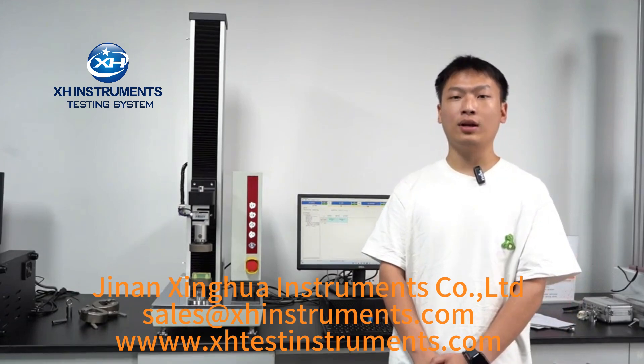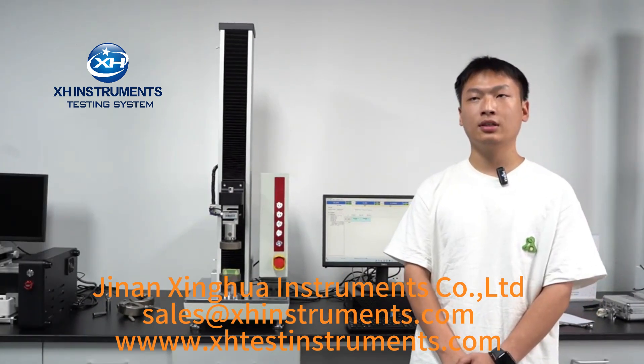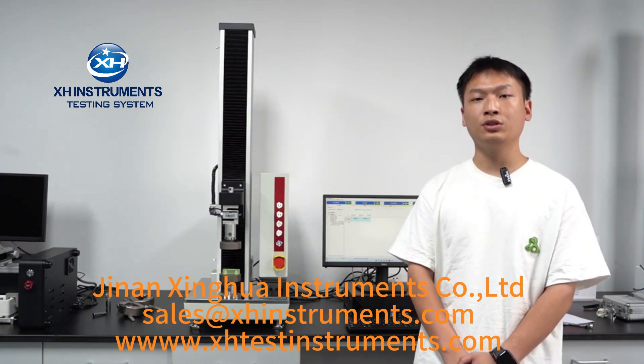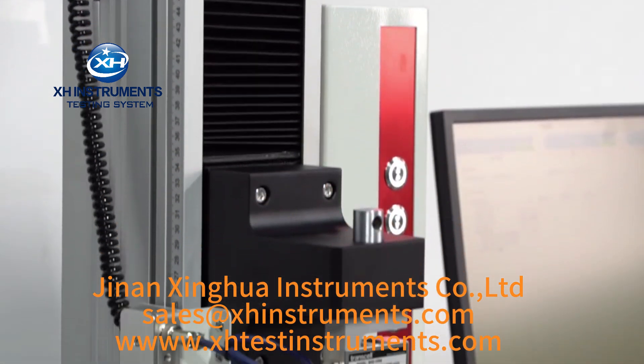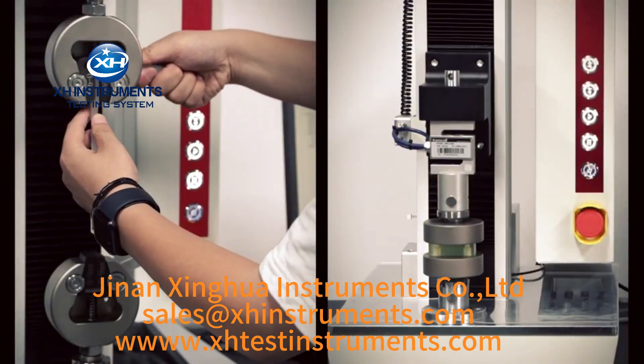Before introducing, I would like to remind everyone that this video is only an introduction to the equipment and cannot replace complete training. Each testing machine is equipped with an operation manual for user's reference. This high-precision tensile testing machine can meet various mechanical testing needs, such as tension, compression, and bending.